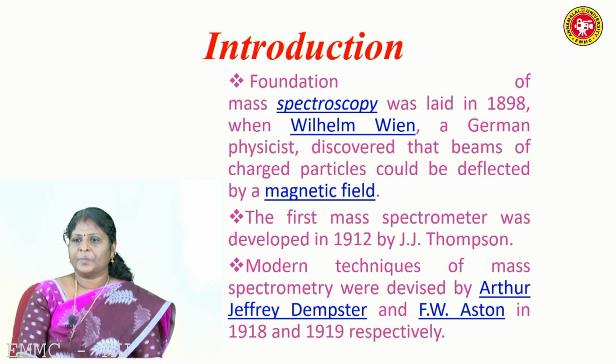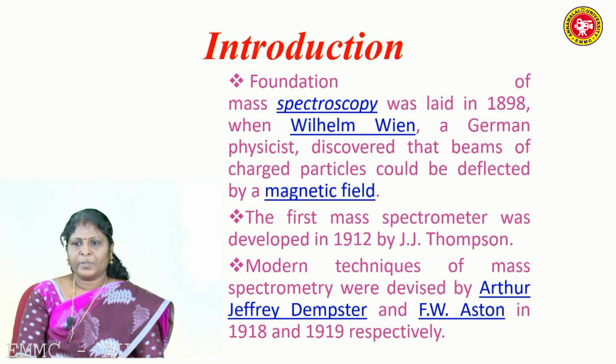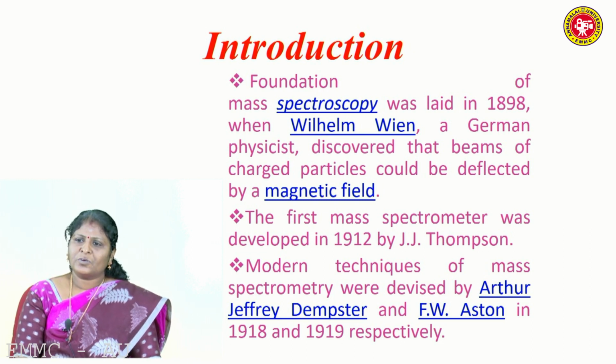In this session, we are going to discuss Unit 3, mass spectrometry, in advanced techniques. Mass spectrometry is a microanalytical technique that involves only nanomoles of molecules. As usual, along with H1, C13, UV, and IR spectroscopy, mass spectroscopy can also be applied, but the problem with this one is that it's a destructive technique. Afterwards, the compound cannot be used as such. Mass spectrometry is the most accurate method for the determination of molecular mass of the compound.